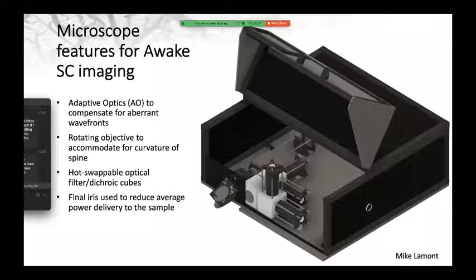Because some of the initial trials that we had, because the objective was perpendicular to the imaging window, the mouse could have ambulated, but the ambulation and locomotion was not quite natural. As a neuroscientist, for the GCaMP activity that we see from these neurons, we want to make sure that they come from natural locomotor behaviors. If it's just random GCaMP activity with errant looking behavior, you can see that there's activity in these cells during locomotion, but it's not really going to tell you exactly what these spinal cord CPG neurons do during a real locomotor behavior.